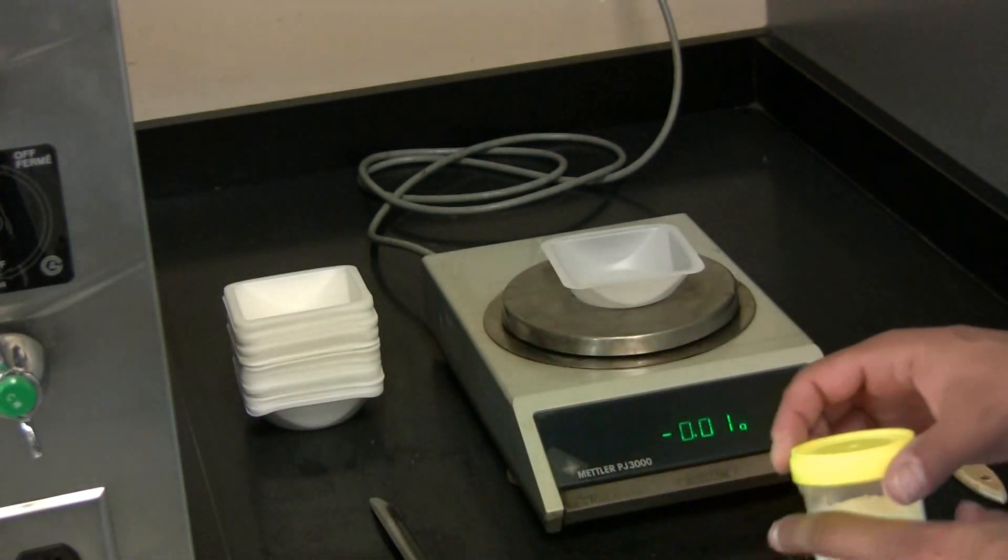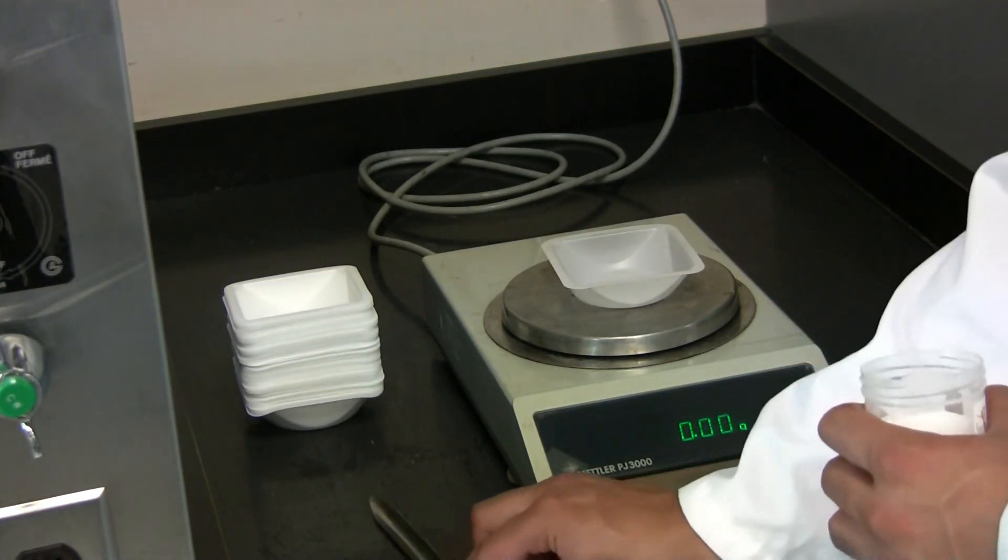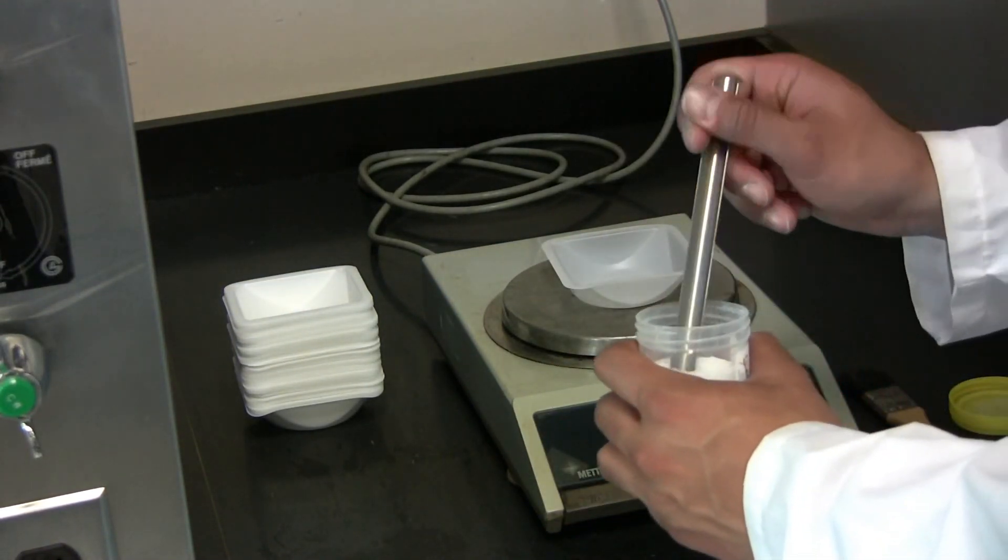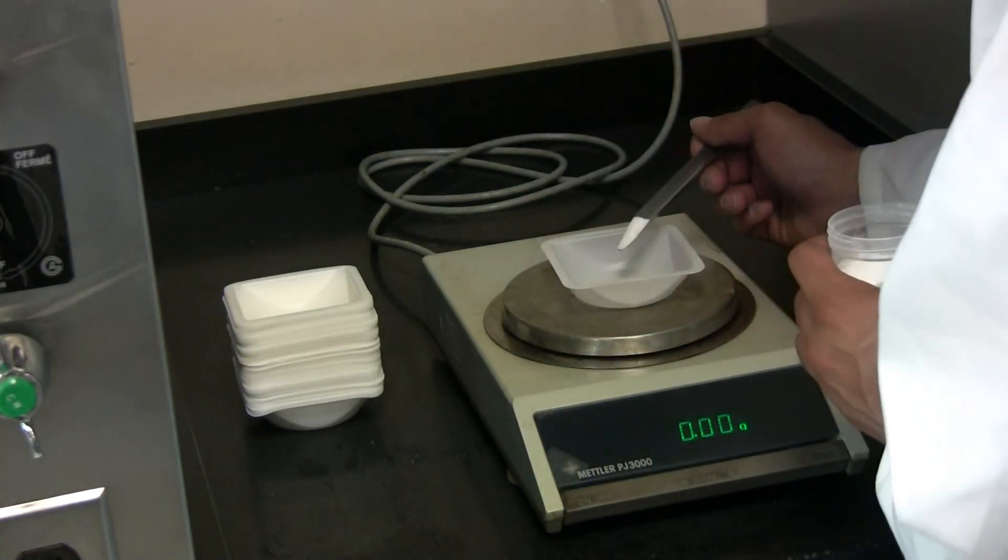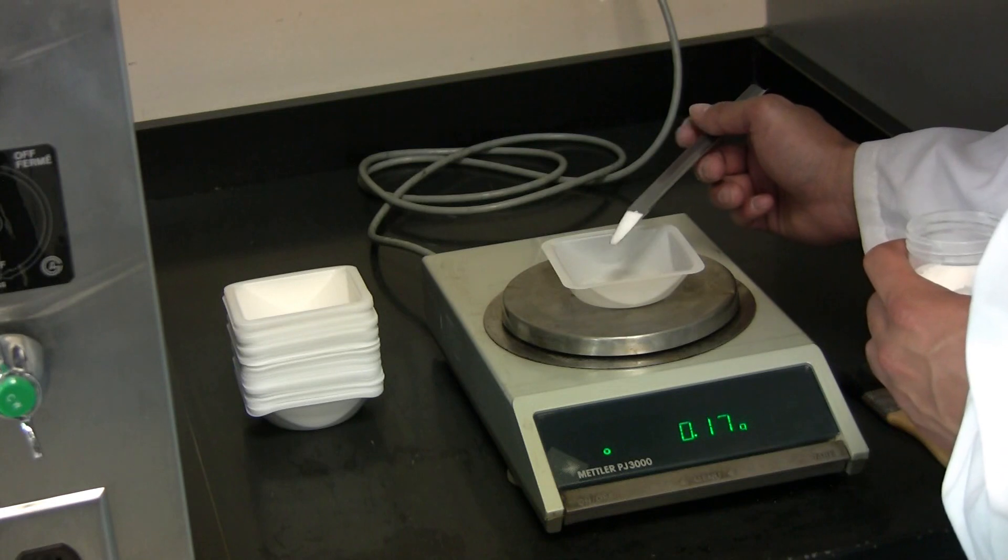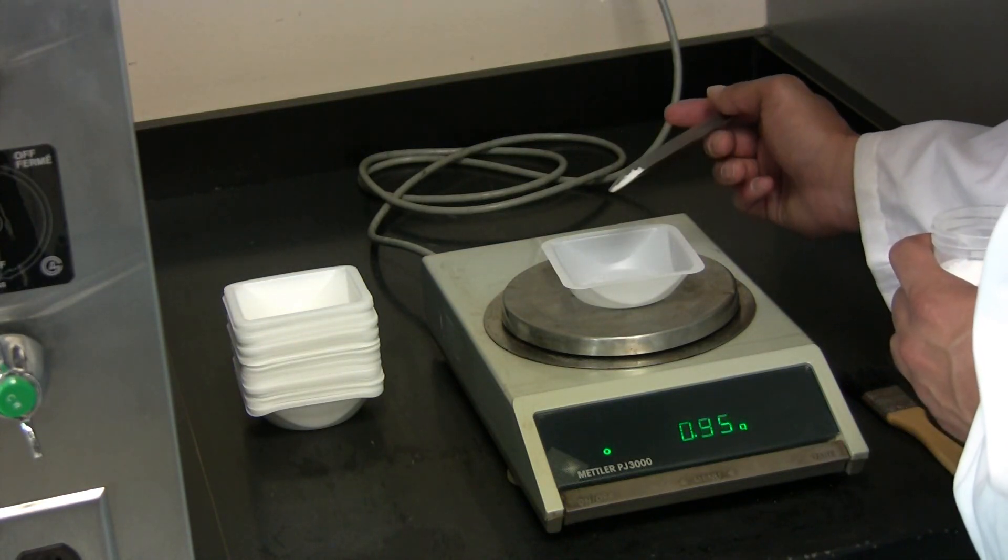Next, take your desired substance and your scrupula and scoop in the specific amount that you need. Make sure not to spill any of it onto the top loading balance, and that all of it remains in the weigh boat.